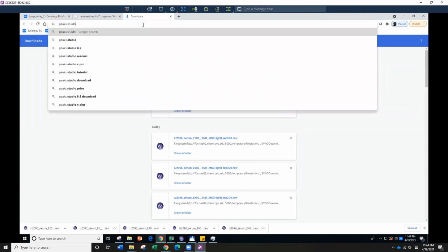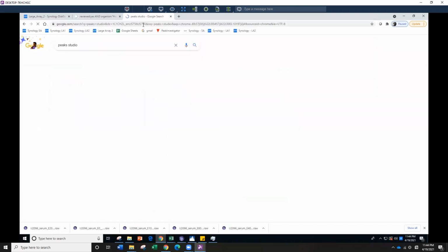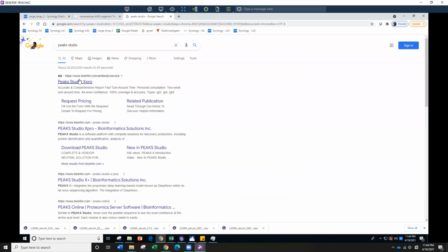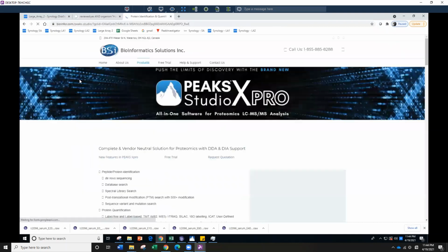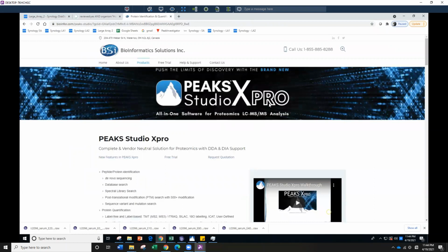We actually pay a lot for the license to their software, and they do really well at answering questions. Asking questions is crucial, and learning to ask the people that have the answer is also a good technique. So call them, they're really friendly and responsive. If you have any questions, you can ask them.